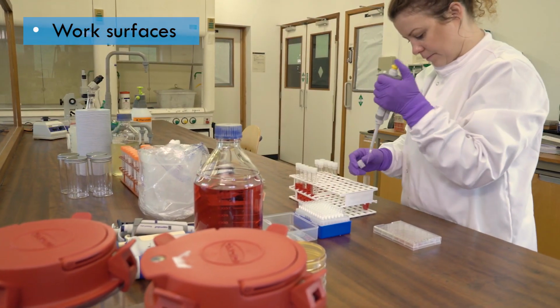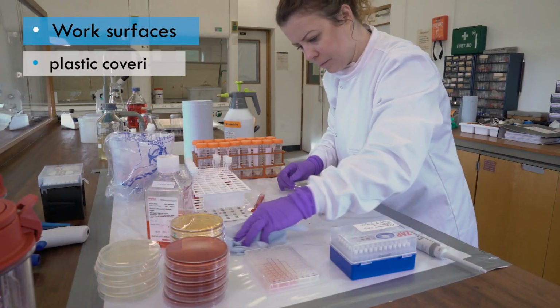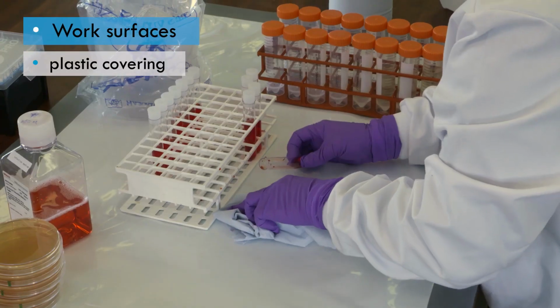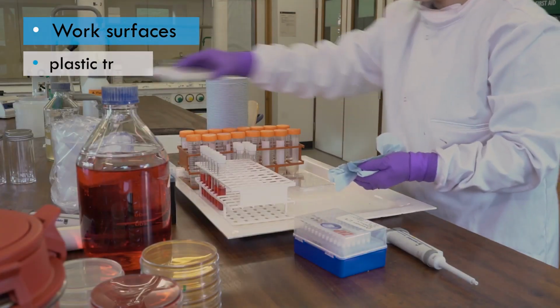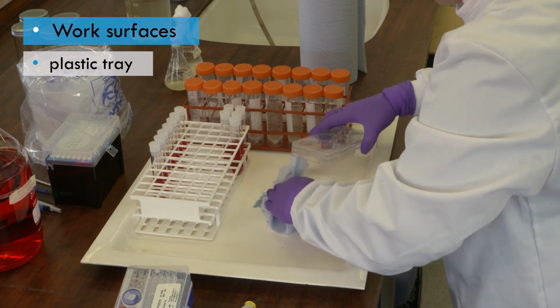Where wooden surfaces are used, it might be advisable to cover them with plastic. Proprietary laboratory bench coating material can be used, or heavy-duty plastic sheet taped in place will do. Alternatively, a plastic tray could be used, which will also help to contain any spills.